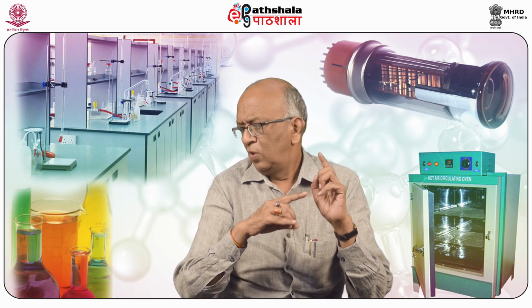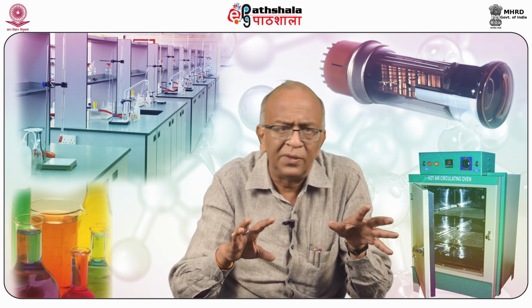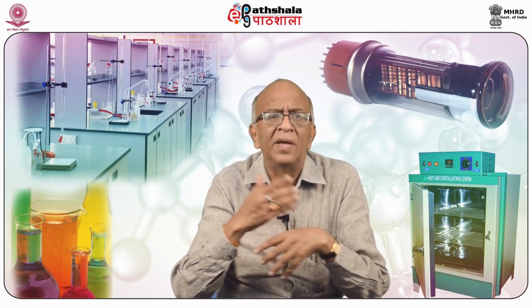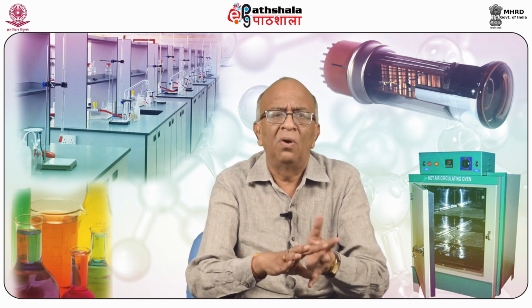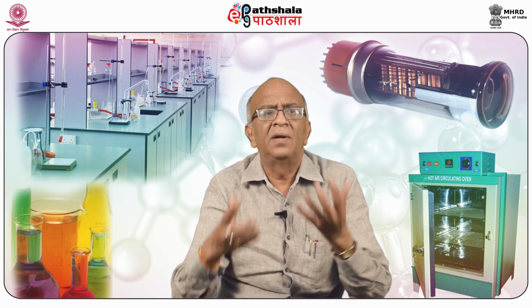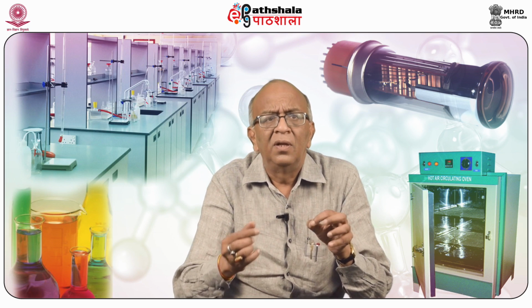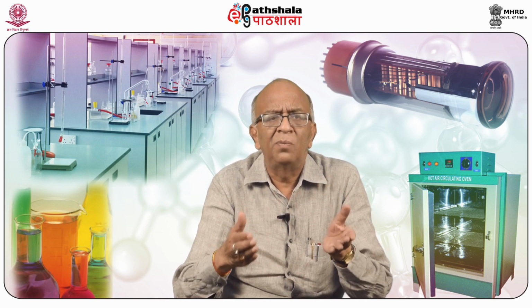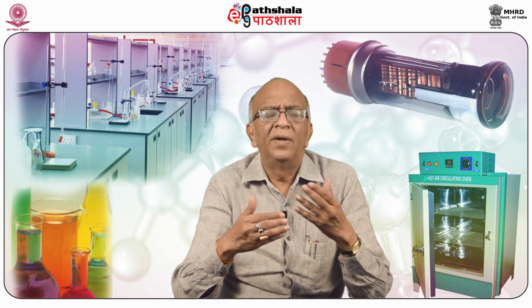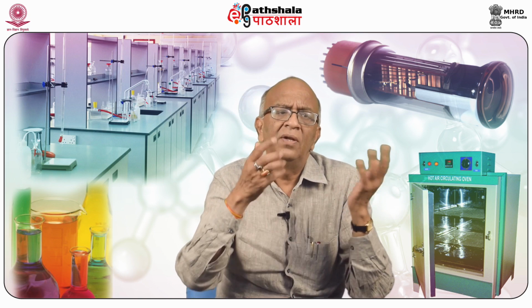For that purpose, you have to apply ultrasonic energy there. An ultrasonic bath has to be used. You will put all the glassware with joints in the ultrasonic bath, and it is the only method for loosening the joints. By that treatment for an hour or two or three hours, you will find that the joints are now released, they can be operated, and again you can use them.